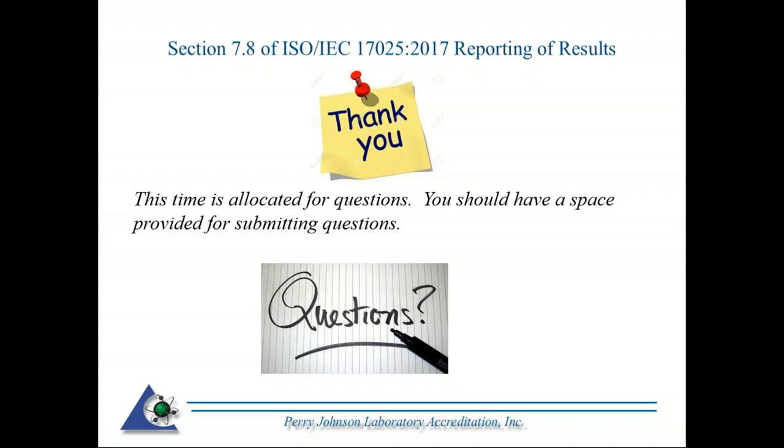Most AFT methods do not state the environmental conditions in this regard. If a lab determines its own temperature and humidity, say 18 to 24 degrees C and 70% maximum humidity, is it okay? Yes, you have to have them documented. If you did your due diligence and made a determination that you can have that much of a fluctuation before it could adversely affect the testing or calibration being done, then by all means, an organization can document their own environmental criteria.